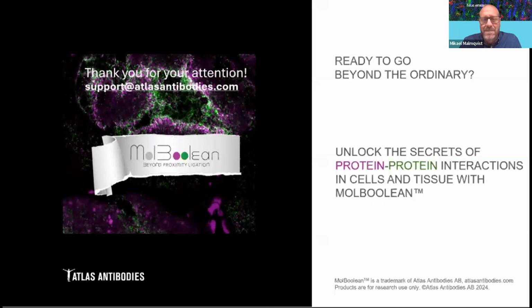How did you come up with the name MolBoolean? Is there a story behind this name? Yes, so Boolean is like the Boolean operators, and, or, not, that are used in mathematics. So we thought this is a molecular Boolean approach: are the proteins interacting or not? So it's just like a word play.